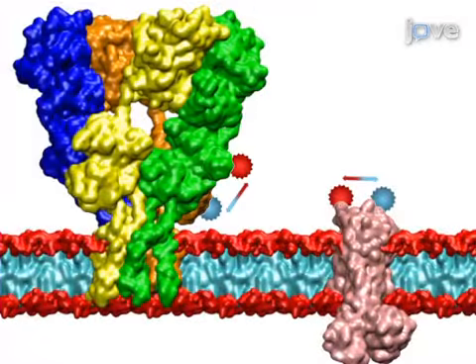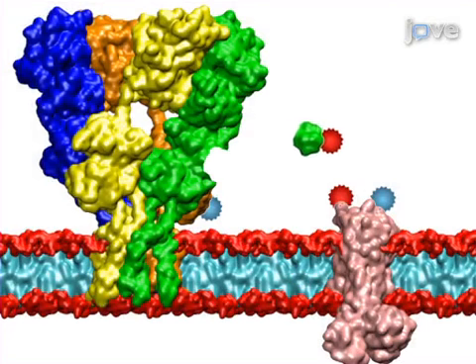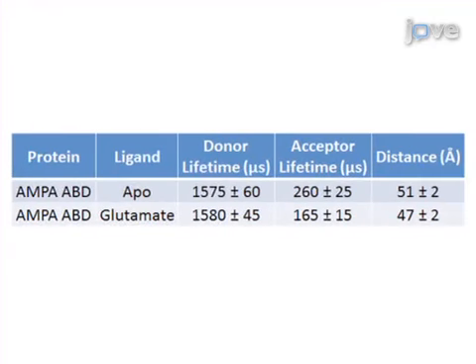Next, the appropriate protease is added to cleave one of the fluorophores and obtain the background signal. Ultimately, the change in the fluorescence lifetime from the resulting resonance energy transfer can be measured to measure the conformational changes that occur in the protein structure.